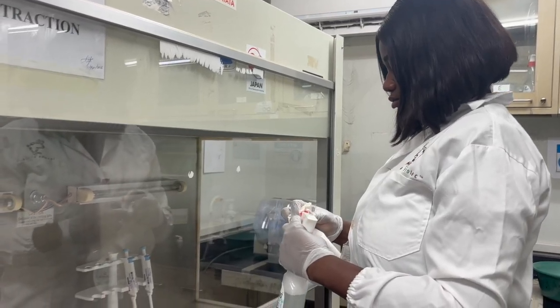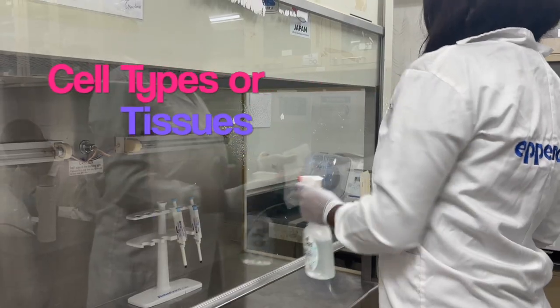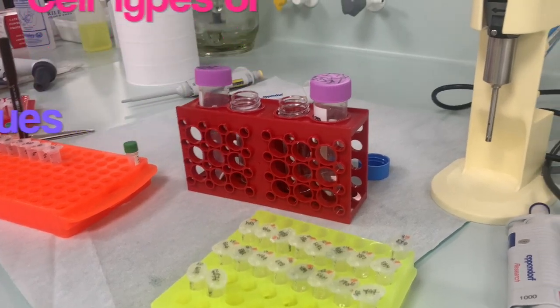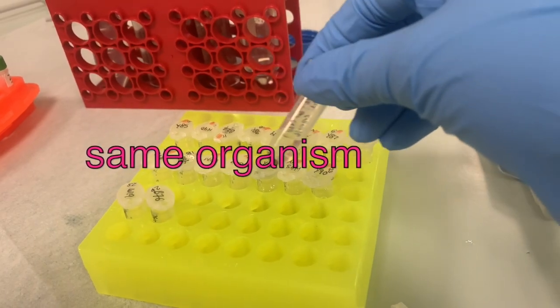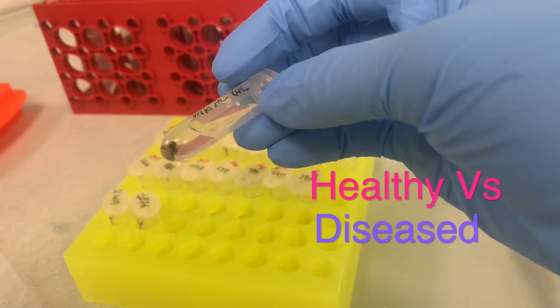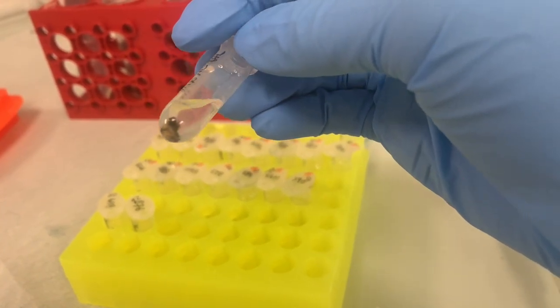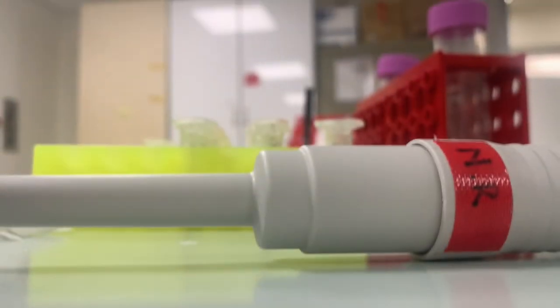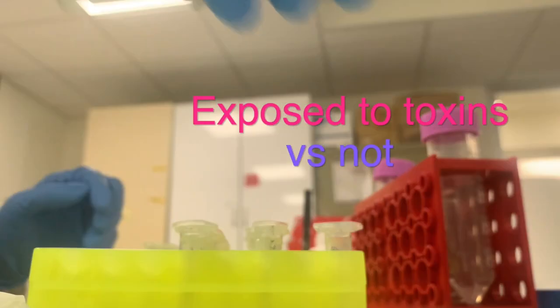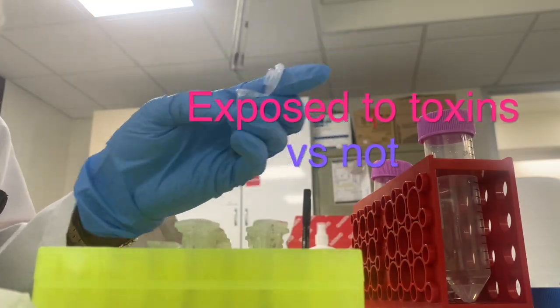So the goal of transcriptomics is to compare gene expression levels between different cell types or tissues within the same organism, or between, for example, healthy and diseased cells or tissues, and also between cells or tissues which were either or not exposed to stress conditions like a drug. So typically exposure to certain toxic compounds.